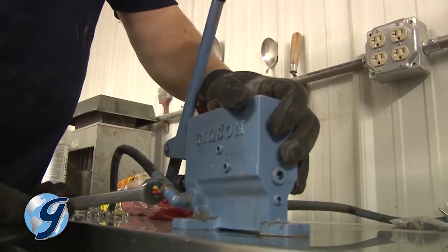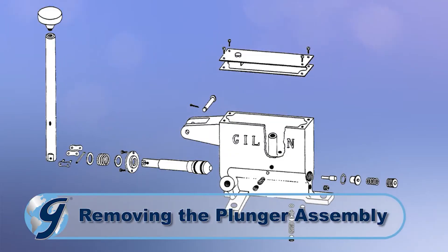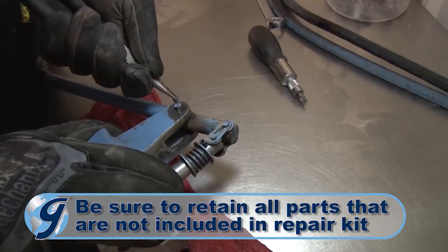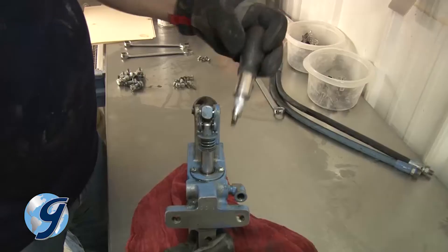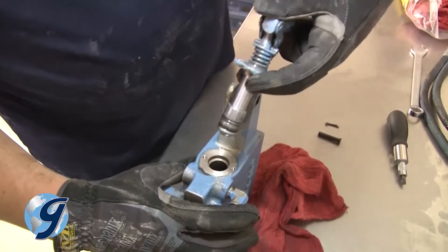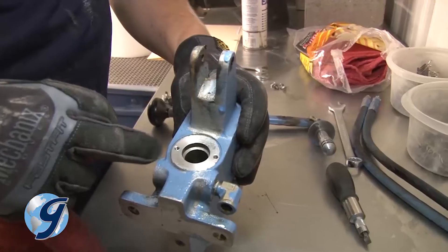Now remove the hydraulic lines from the pump. As you begin to work directly with the pump, be sure to have the testing screen manual handy for reference. Next, remove the cotter pin from the pump handle assembly and pull the pin and set them aside. After the handle has been freed, take out the two screws from the plunger guide and seal. Now remove the plunger from the pump body and inspect the plunger and pump housing to make sure that there are no visible scoring.